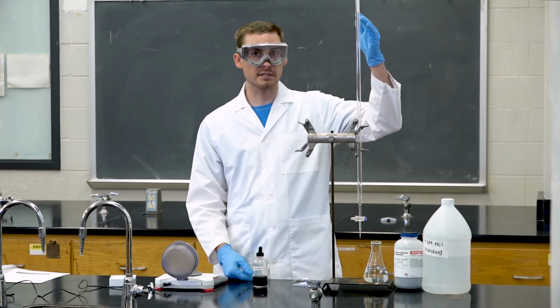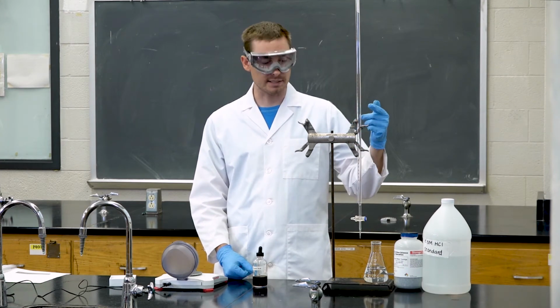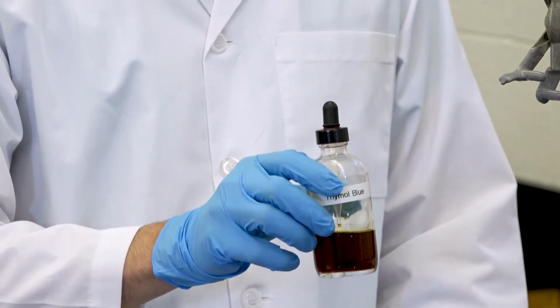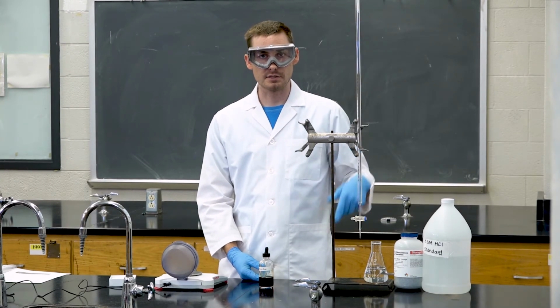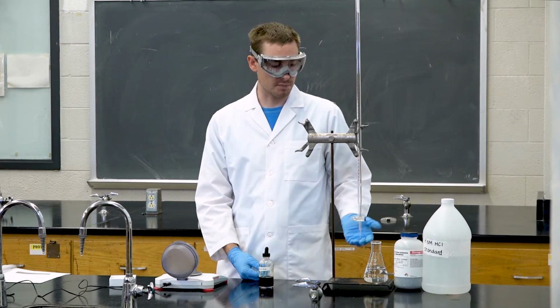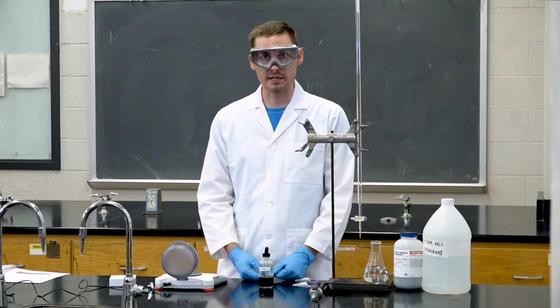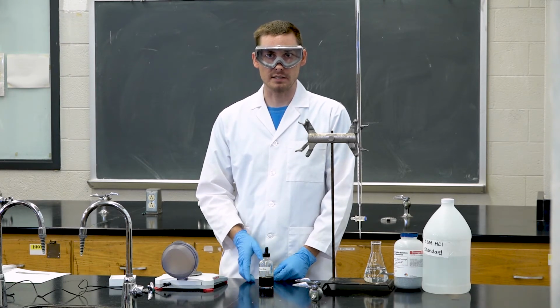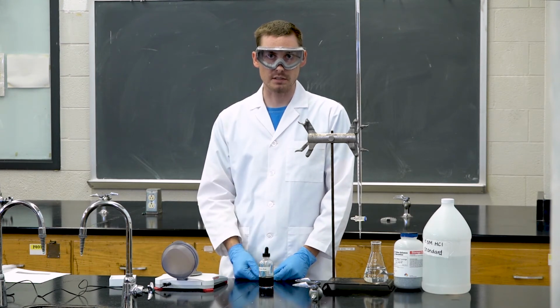We will then add a standardized solution of 0.3 molar hydrochloric acid to the burette, which will be the acid that will be titrating into the base. The indicator we're going to be using is thymol blue. So as we titrate the solution, the amount of acid that we add to the basic solution that we're going to form with the calcium metal will be able to tell us how much base was in the solution. Knowing that number and knowing the exact amount of calcium metal that we've added to the solution will tell us how many moles of base or hydroxide ions were formed for the number of moles of calcium atoms that we have added to the solution here.